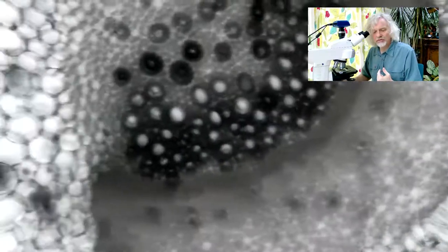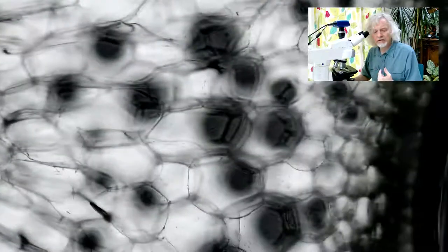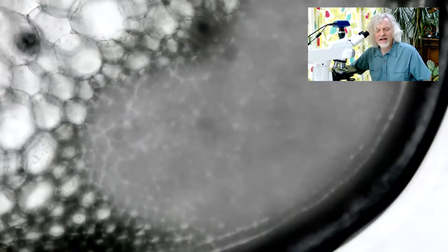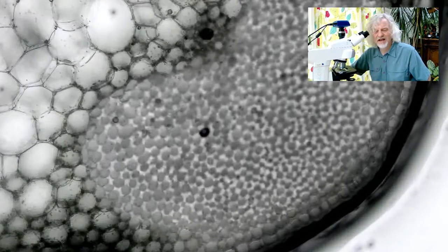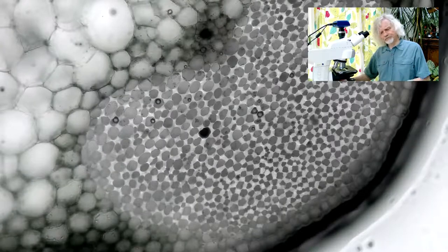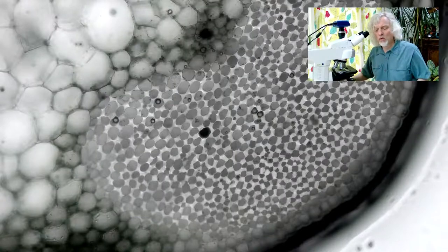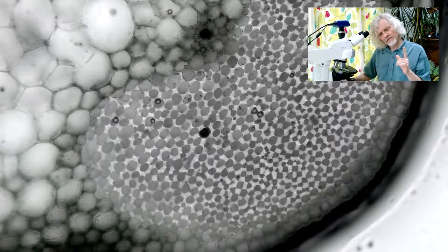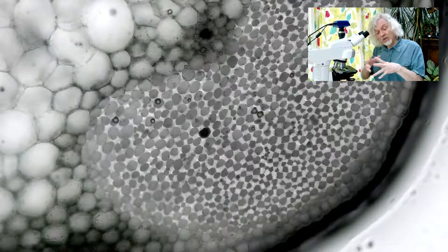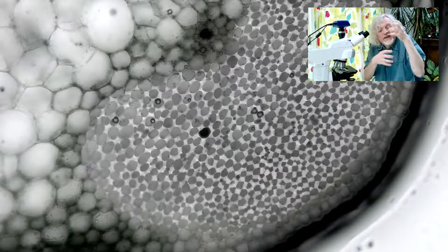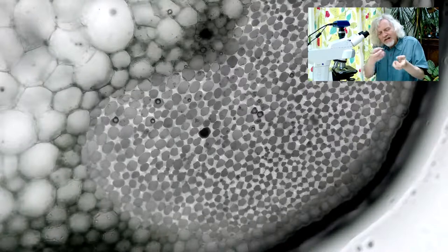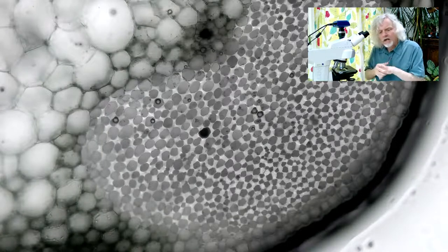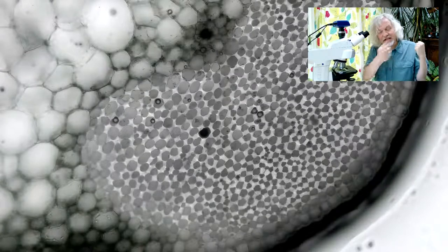Now, if I go back out to this section here, there is one other interesting section, which is this section here. This section here is known as the colenchyma. And colenchyma is a special type of tissue. And if I adjust the focus to there, you can see that the colenchyma also has thickened cell walls. So what you're seeing here, the dark bits are, let me get this straight, the thickening in the cell walls. So the outside of each of the individual cells has been made thick, which means the whole thing becomes really rigid. And these are the stringy bits of celery that's right underneath the skin, and the xylem and phloem is a bit deeper in. And only on really old, tough celery can you actually pull those stringy bits out.